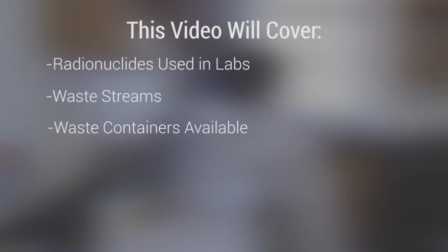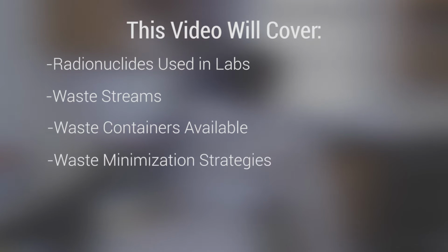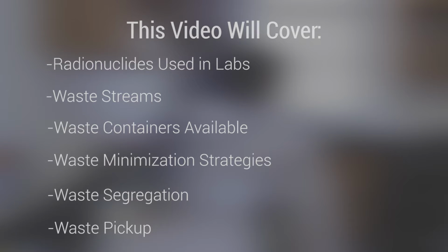This video will cover radionuclides used in labs, waste streams, waste containers available, waste minimization strategies, waste segregation, and waste pickup.